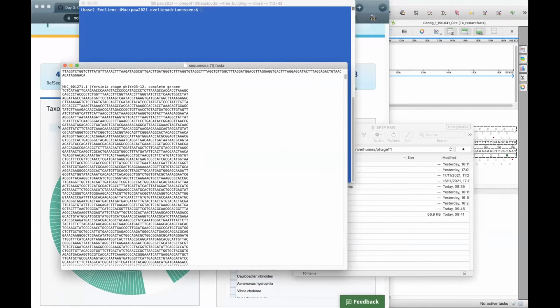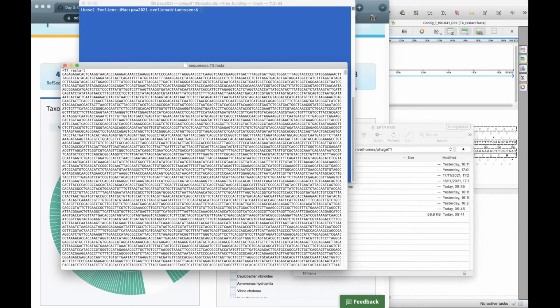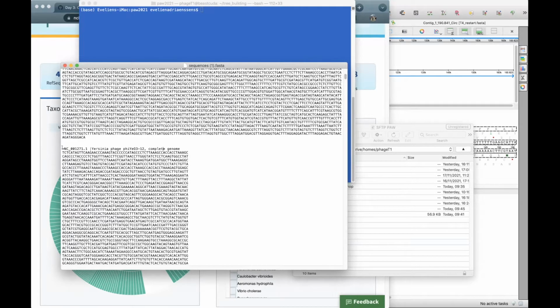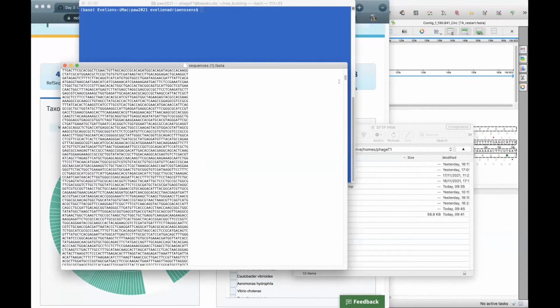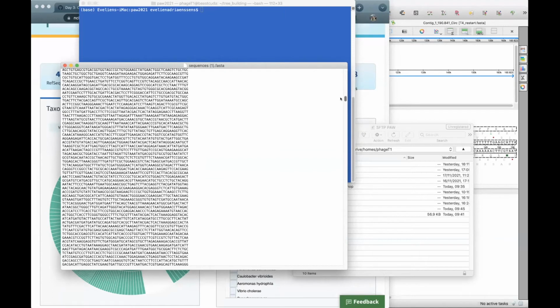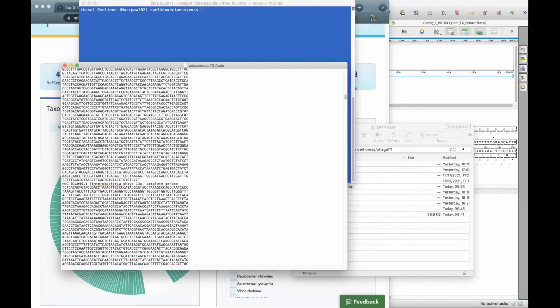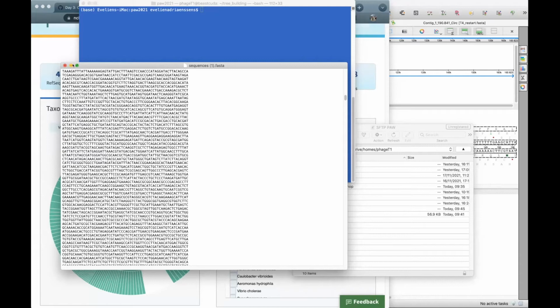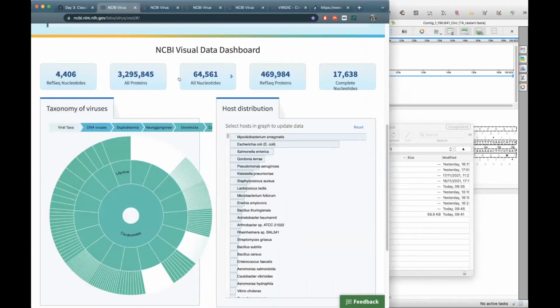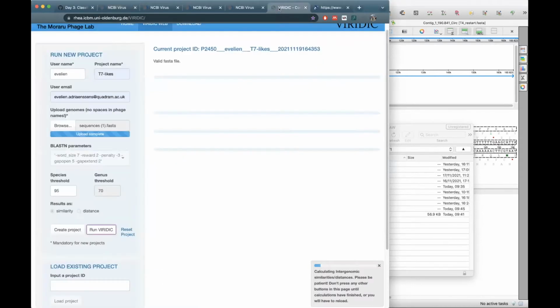So this is basically what I did. The first sequence I pasted in, which was my T7 restart. And then the rest of it was the automatic download, and I didn't change anything. It just came like this. All the downloads were together, and then you just added the other one at the beginning. Yes. Perfect. Yes, they were all in the same file. So if you go further, you can see all in the same file. Thank you very much. So that's the upside for me about the NCBI Virus. It easily allows you to download all of them into one thing that you then use further.